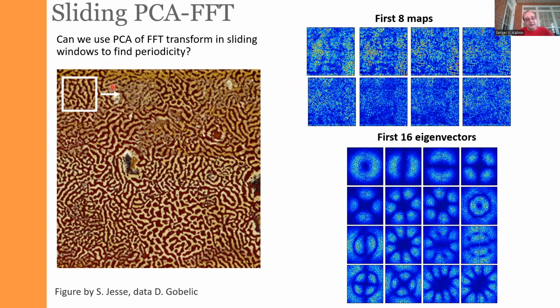So if I take this image, break it apart in the patches, and then I apply the PCA, then my loading maps show something. You can see that there is some reverberation patterns, but generally there are regions with a stronger intensity, a weak intensity, and so on. But my eigenvectors, in this case the components, are images, and they start to look like the example of the orbitals from the quantum physics textbook. And there is a very good reason why it is the case.